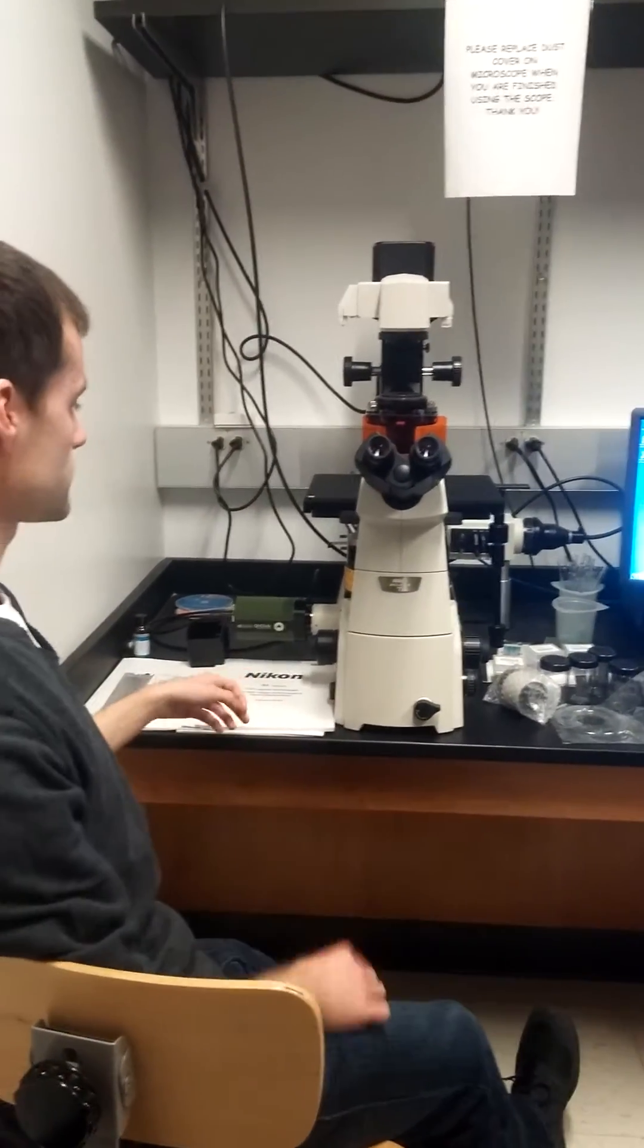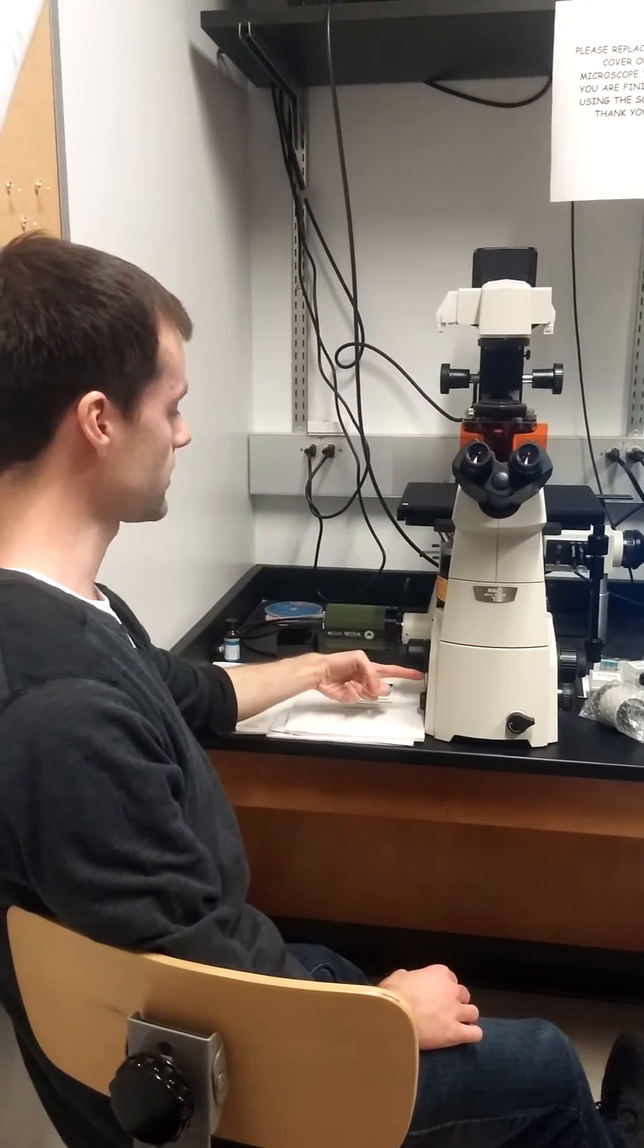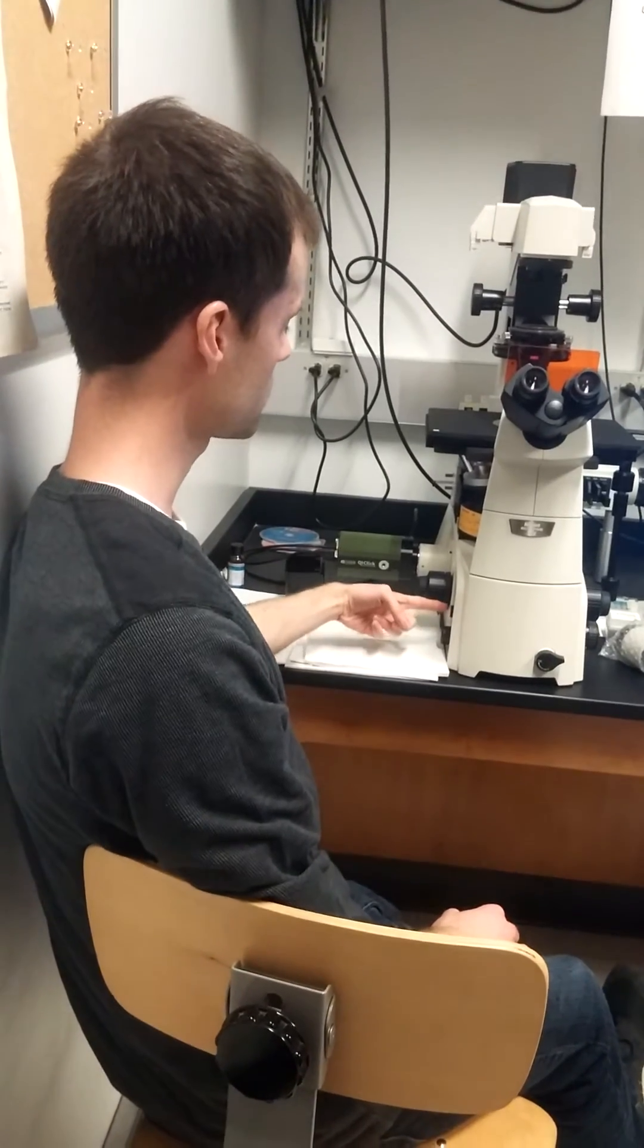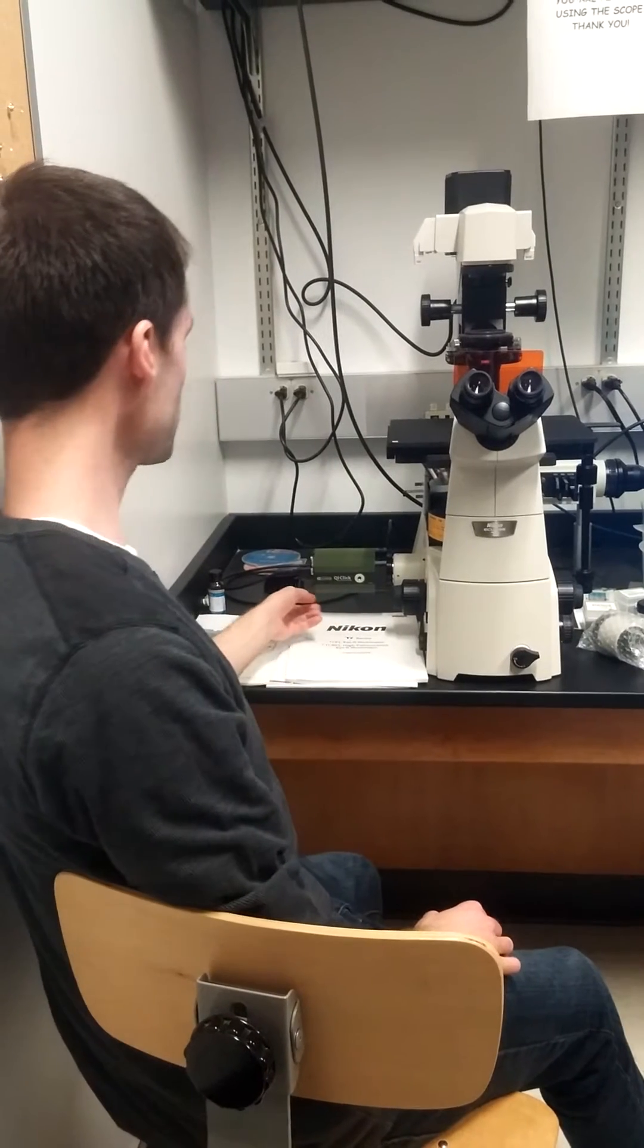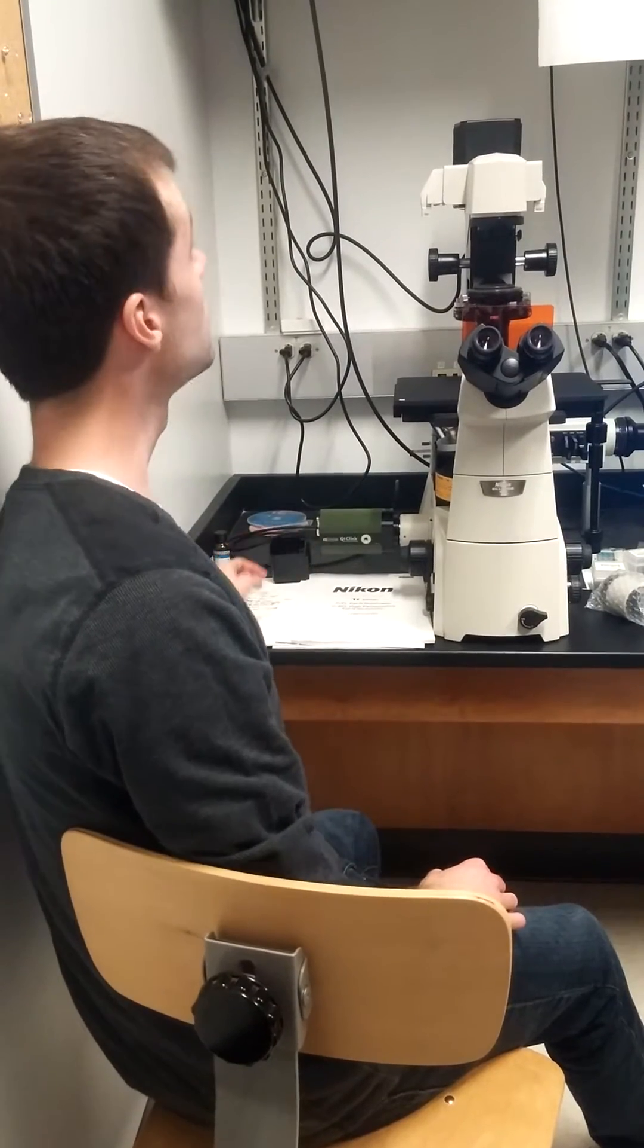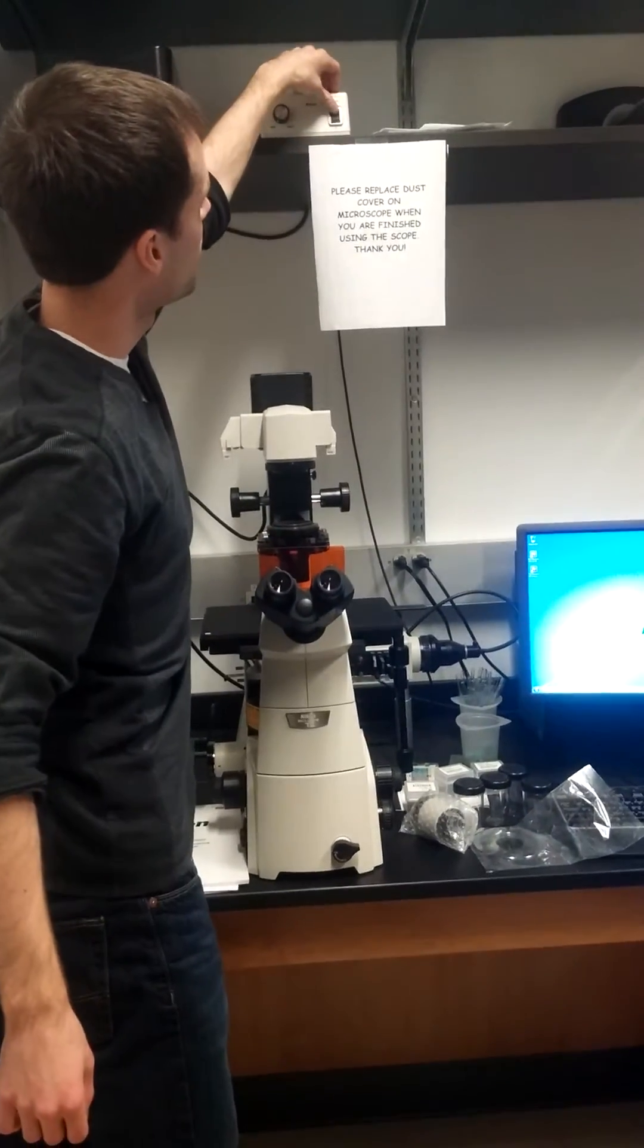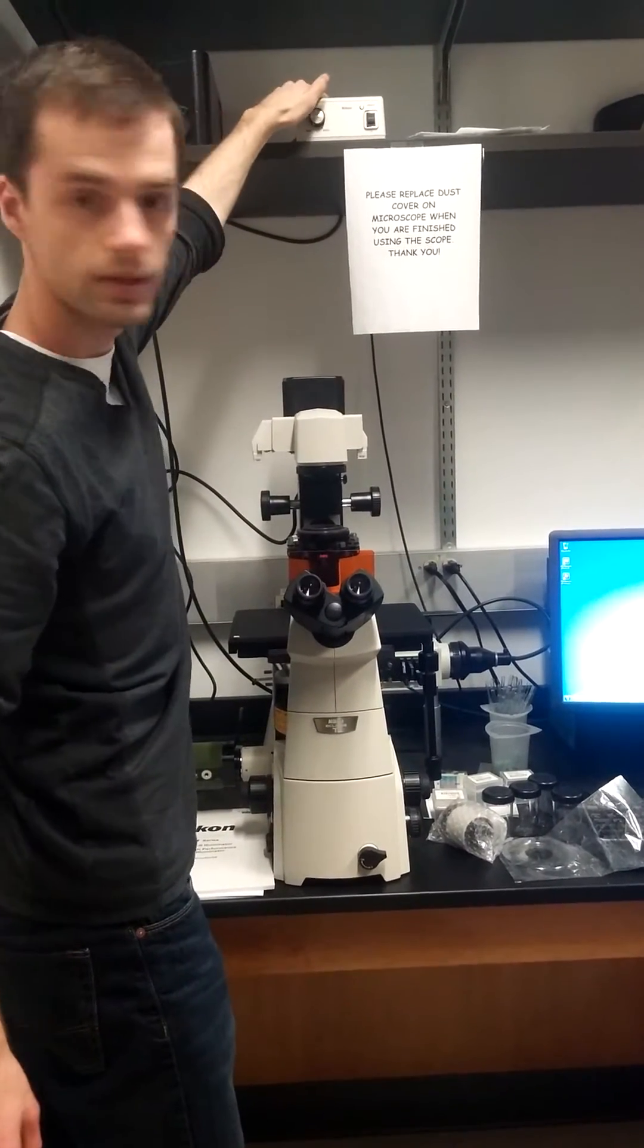Next thing is to start up the microscope by hitting the power button located on the left-hand side here. It's just a little white button. Push that in. Next we'll turn on the camera which is located on the left-hand side and it's just a switch that we're going to press down. And third, last power button for a while, is this power supply to the microscope which controls the lighting.